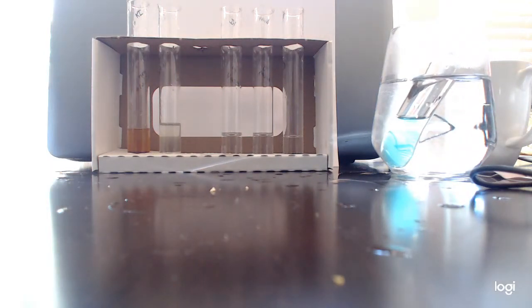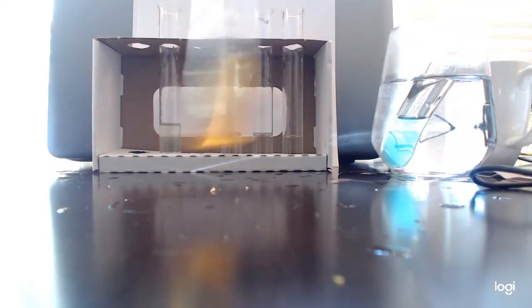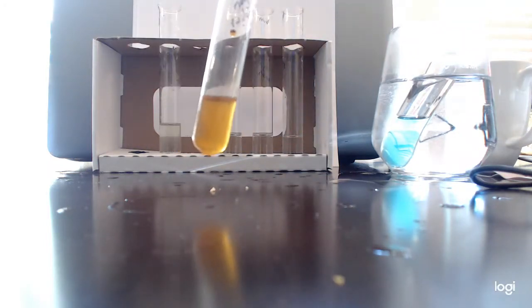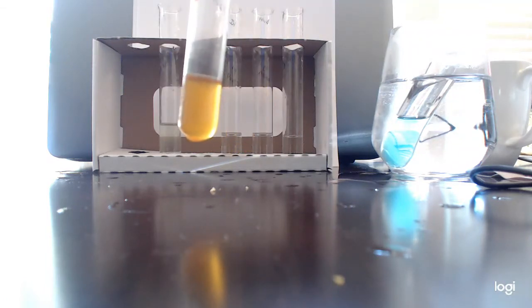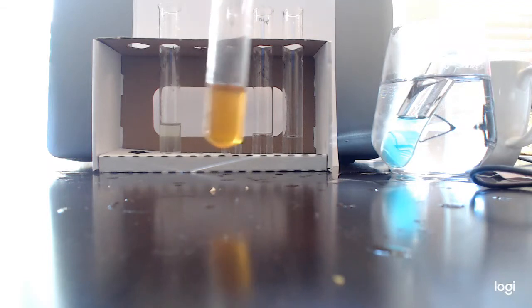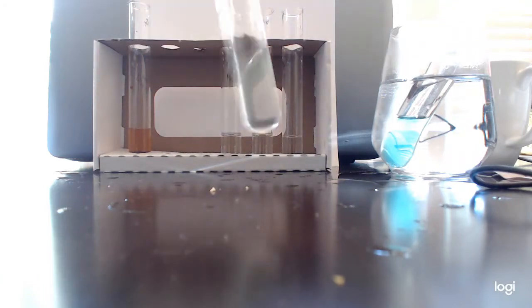And let's go ahead and look at our tests. So orange juice, when mixed with potassium iodide, remains brown, browny yellow. So what is this? Is this negative or positive for starch? If you're thinking this is negative for starch, you're correct. Orange juice is negative for starch. Let's go ahead and mix this around.